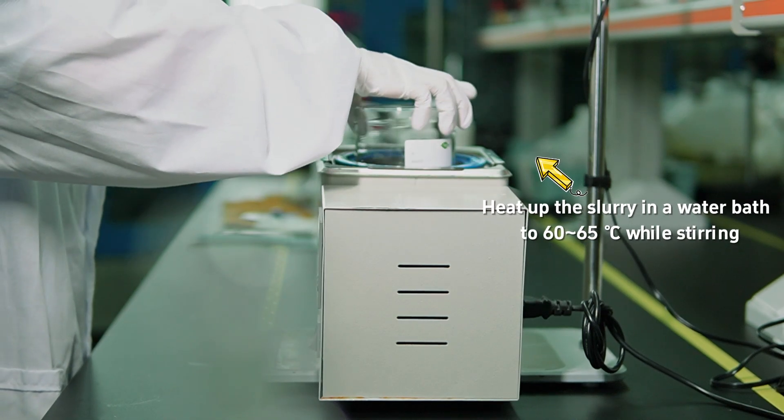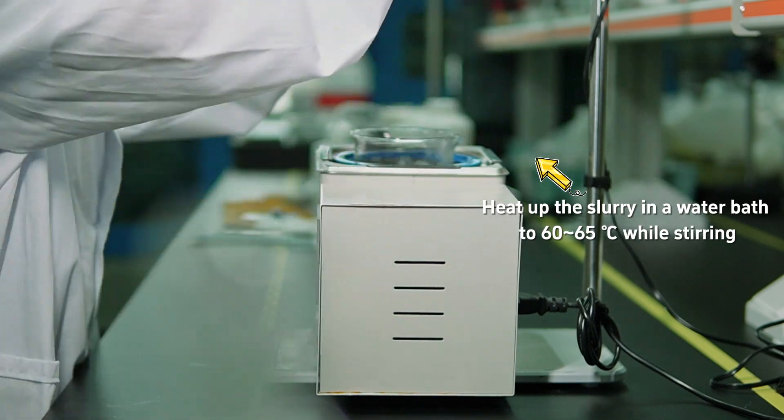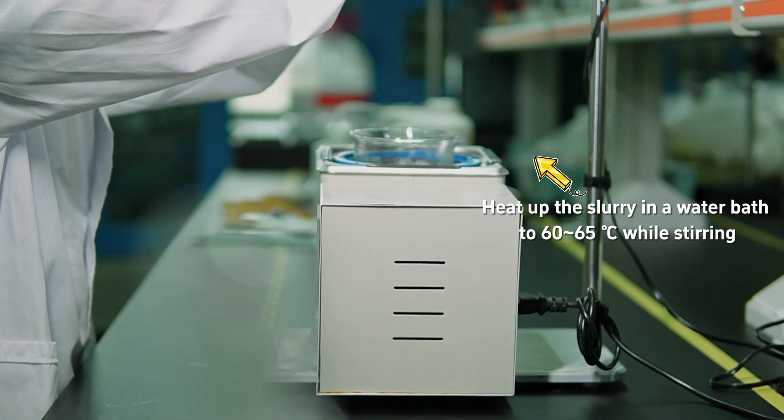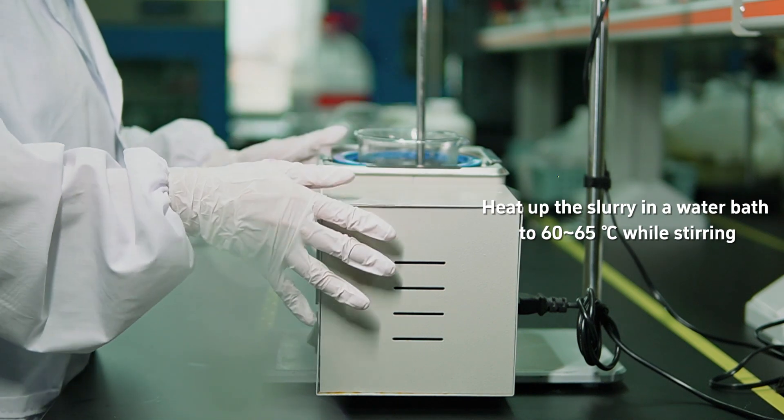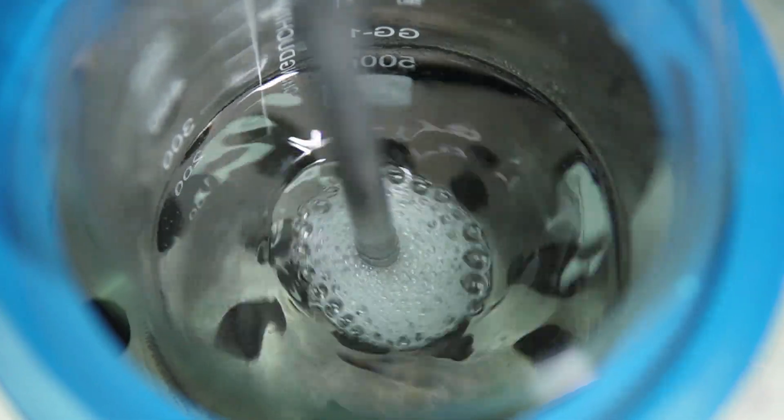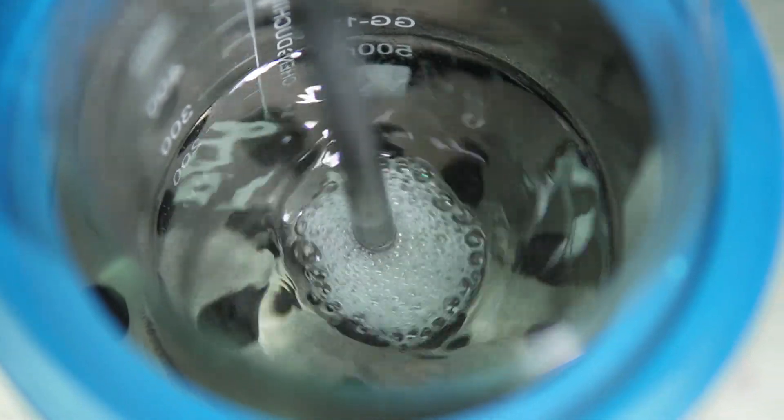After adding the SLES, the next step involves some heat. We place our beaker in a water bath, raising the temperature to between 60 and 65 degrees Celsius. This is essential because SLES in its gel form doesn't dissolve easily in water. As we heat it, we keep stirring until the mixture becomes completely transparent, which implies that SLES is fully dissolved.